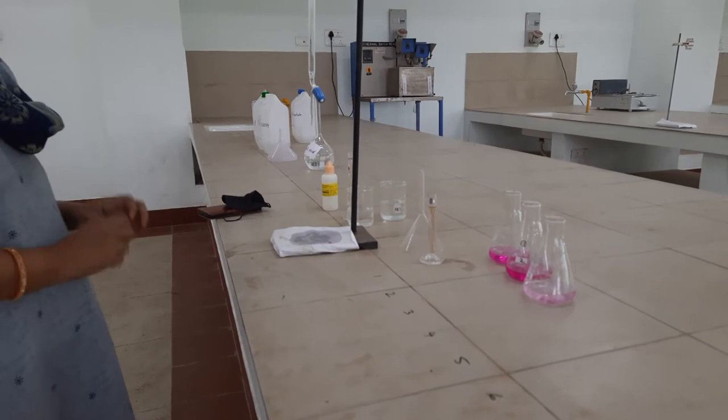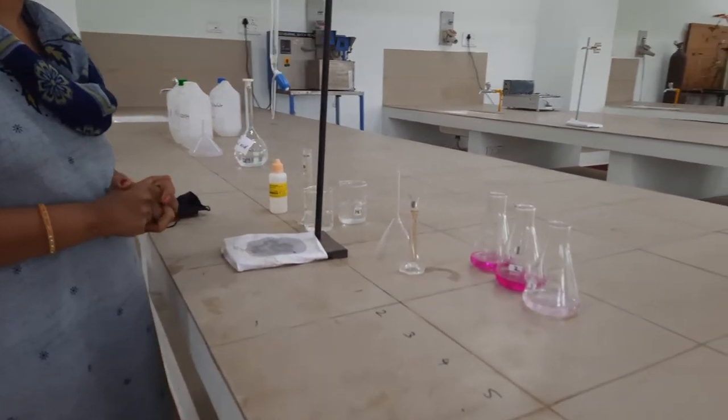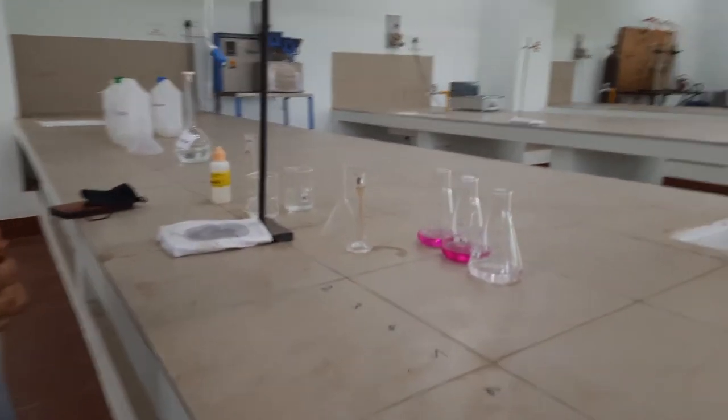So we have completed the titration part. We have noted down the three endpoints. Remember, each experiment is performed three times to have a concordant value of endpoint. Then we will proceed to the calculation.